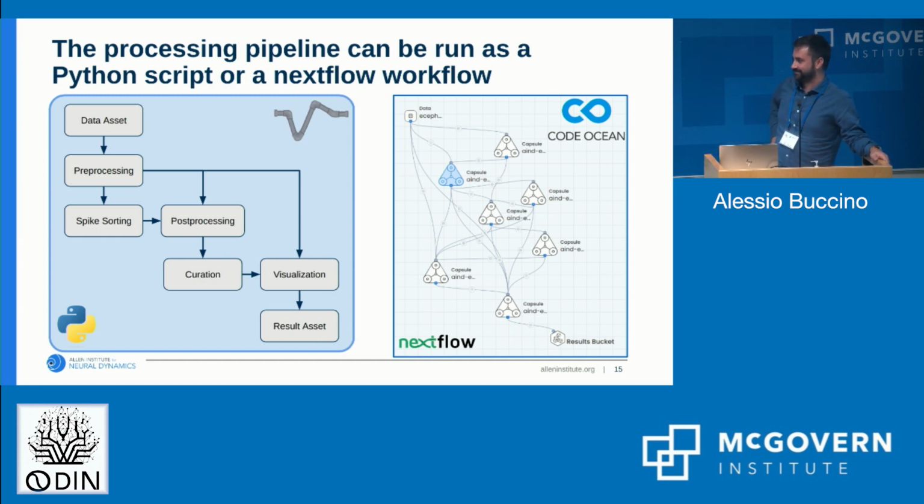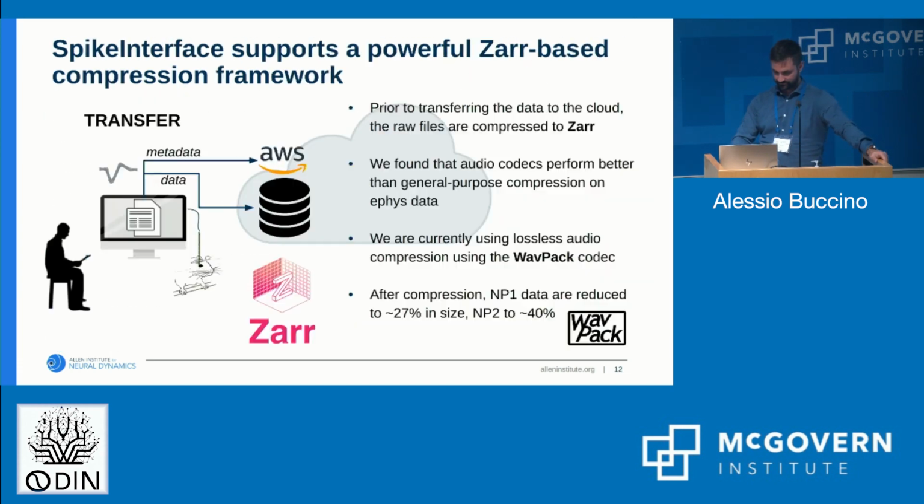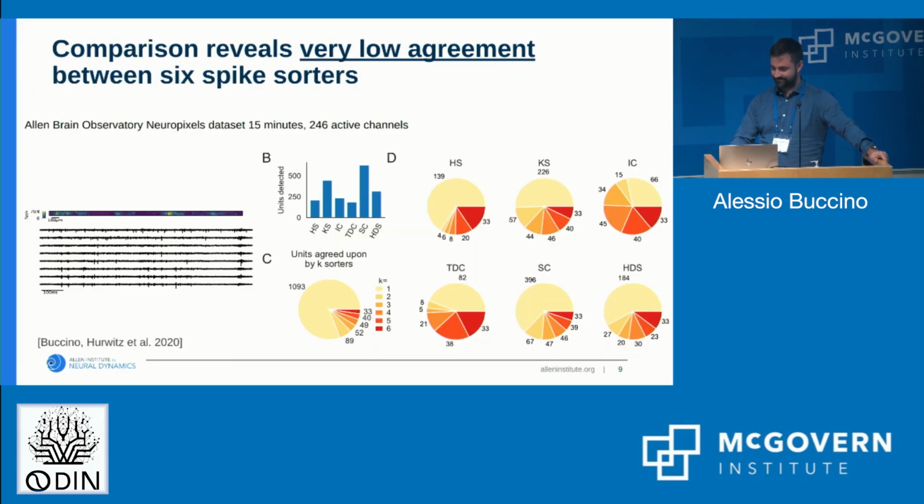Thank you. So I actually had maybe a technical question about this comparison of all the different spike sorters where you get down to the 33. I was struck by it being a very short data set, 15 minutes. I'm just wondering, as Andreas mentioned, we're always strapped in space and time, does this hold true if you had, I don't know, 6 hours of continuous recording? I think it would be worse. You think it would be worse? Yeah. Okay, so that's what I wanted to know.